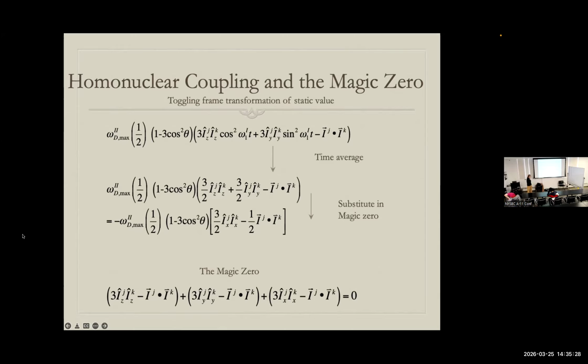It's an infinite network where, in order to say that our cycle times really are short compared to the strongest couplings, we need to be spinning at 500 kilohertz. So we get very excited about going from 100 to 150. I get excited. I think it's super cool. But actually, it's not where we need to be either. And the same thing for the RF. We love to go from 100 kilohertz to 200 kilohertz. But the reality is that it's still not the small angle approximation. Okay, it'll all converge when we're around that, and we're not close to that.